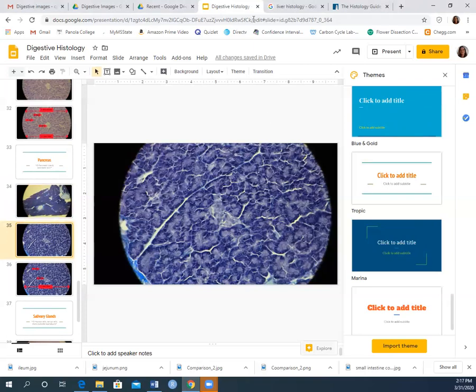I'm going to put a circle around the pancreatic islet. Remember your pancreatic islet from the previous, I think it was 2 units ago we did the pancreas, and we talked about that wad of lightly colored cells is called your pancreatic islets. So that yellow right there that I just circled, that's a collection of pancreatic islets right there, okay?